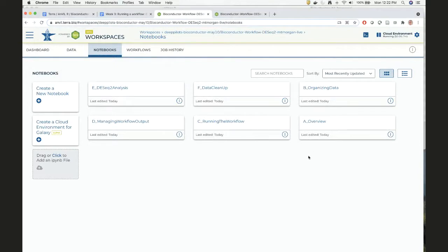Here's my pet peeve. I've probably said this a bazillion times already. I always want these to be sorted alphabetically, and every time you navigate away from this notebook page, it reverts to sorting them by last modified date. Usually you'll modify the last thing that you did, so it might make sense in some circumstances, but it's always wrong for me. I'd like it to stick at alphabetical. So I just wanted to open this overview notebook.